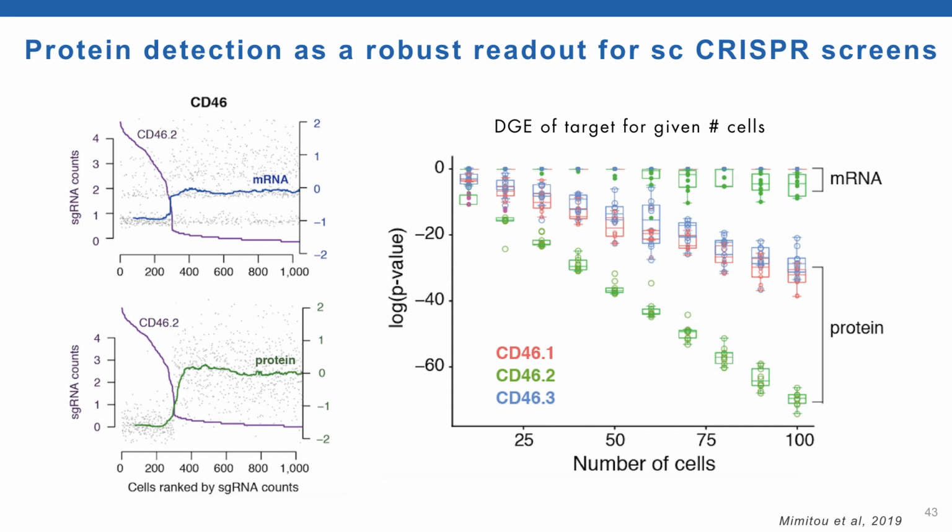This will hopefully give stronger data, but also mean you won't need to interrogate as many cells for a particular perturbation, which will then hopefully have the flow-on effect of being able to screen more perturbations in a single assay.